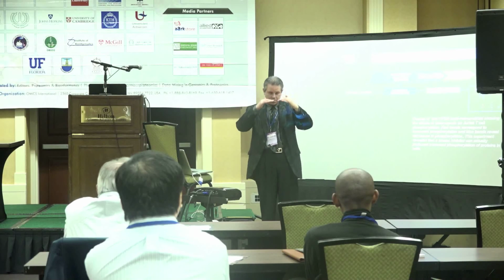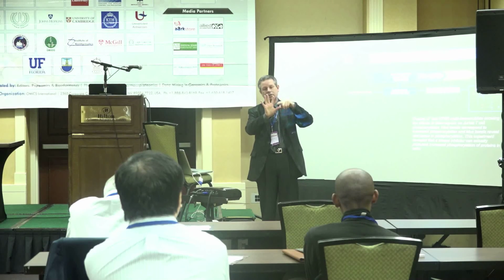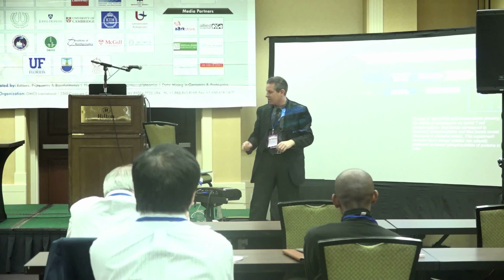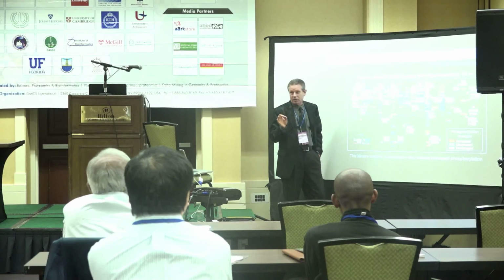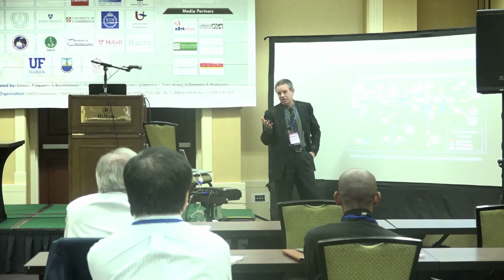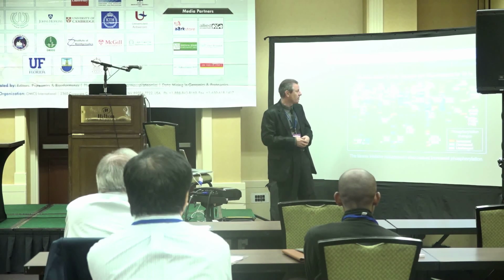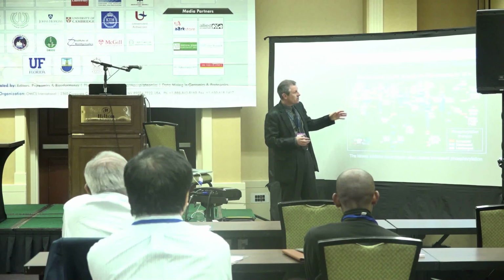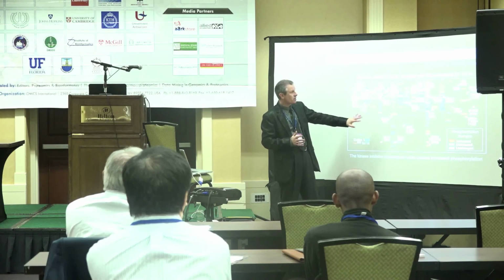We run an SDS page gel with one lane down the entire gel. The multi-blotter goes on, and in the different lanes, you have different antibodies. And so we get like a 2D gel. And we can overlay these images. And so now, unlike a regular 2D gel, where you're not seeing low abundance proteins, we can see low abundance proteins and we can quantify them. And we know they're the right proteins because of the molecular weight. And what you see here is an overlay of two gels. The control gel, these are cells that are treated, Jurkat cells.